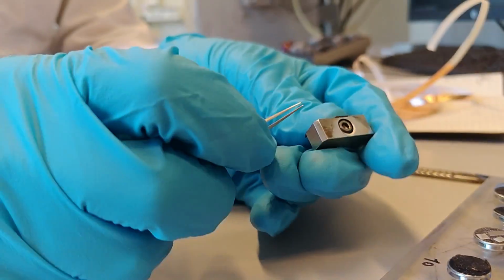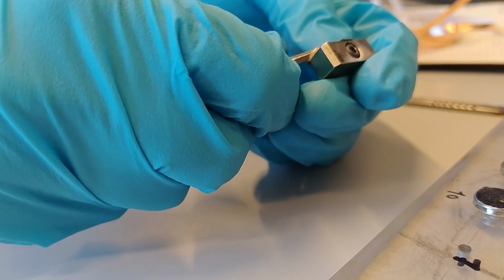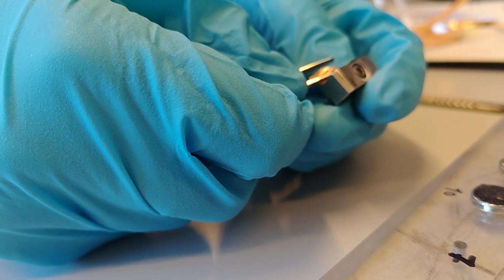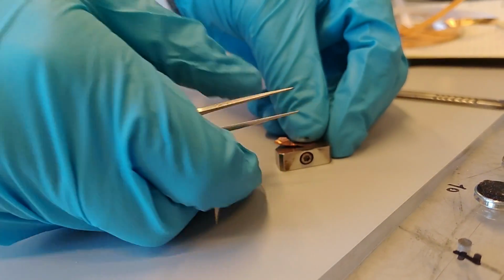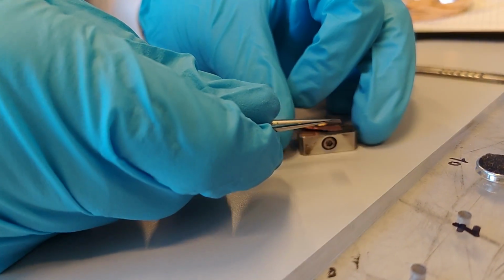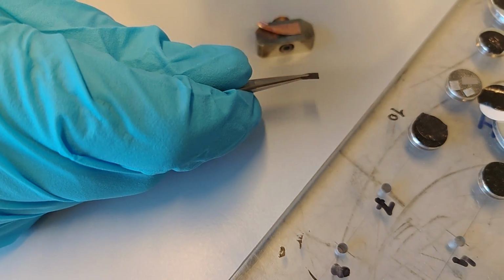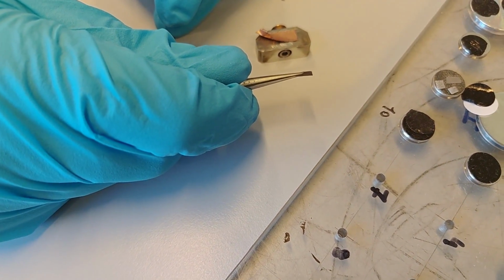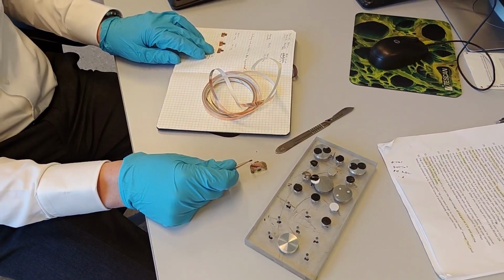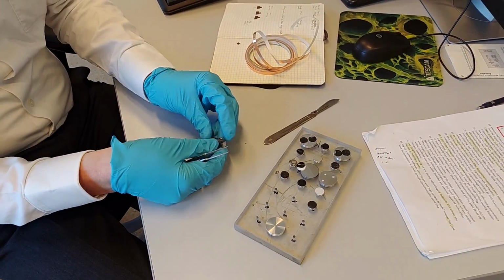After it comes out from the machine, we want to remove it. I think this electrode that I have here is super fragile, so it's even detached from the tape by itself. The top edge here facing the camera is of course the cross section, so we don't want to touch that. If you have several samples, one can just put the tapes like this in your notebook to keep them for later use. Remove that one also.